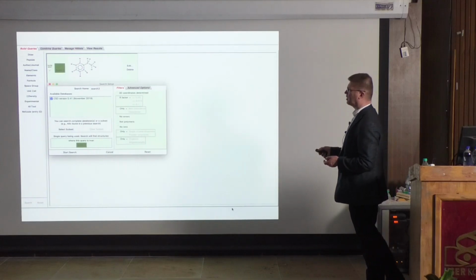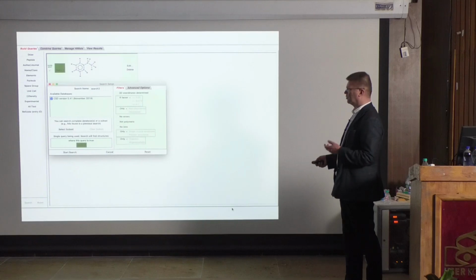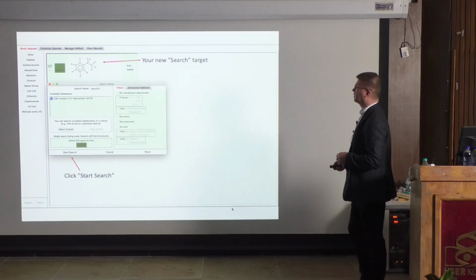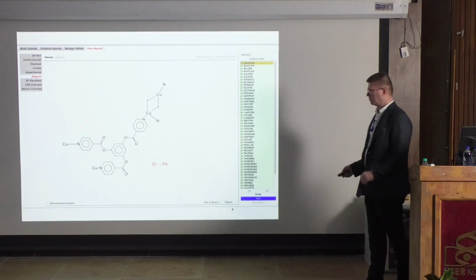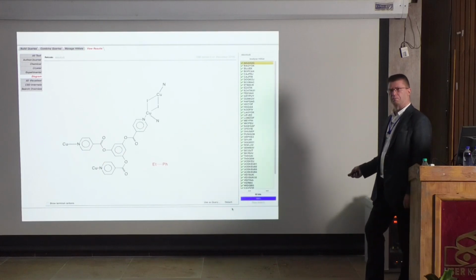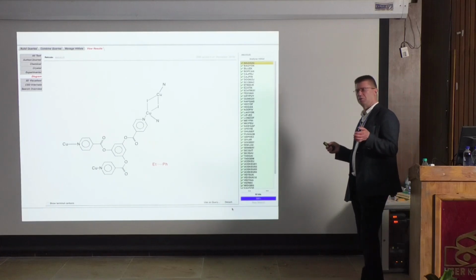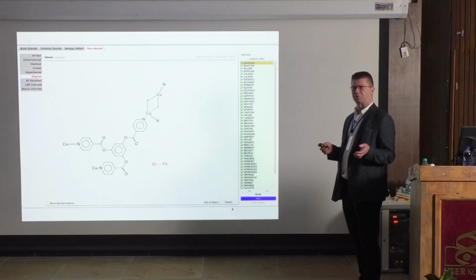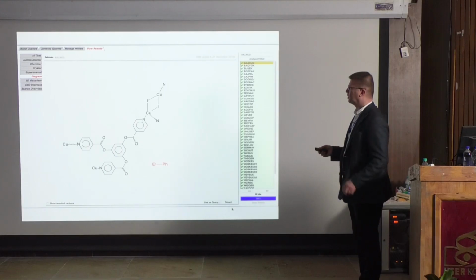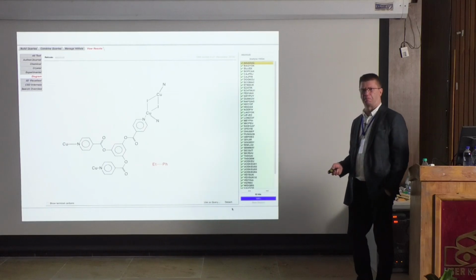So look, we added hydrogens. Now this is really a benzene. And now we do the search again. Click start. Now it became interesting. Now it's 52. So only by defining that it's a benzene ring, we kicked out more than 2,350 structures. And now you can see what is ethyl benzene.